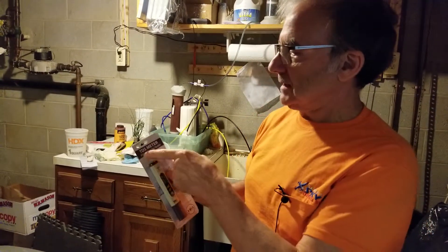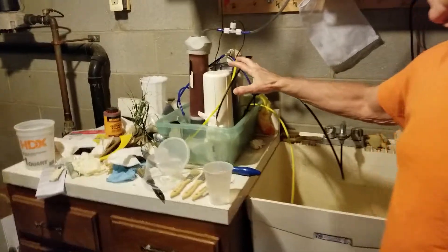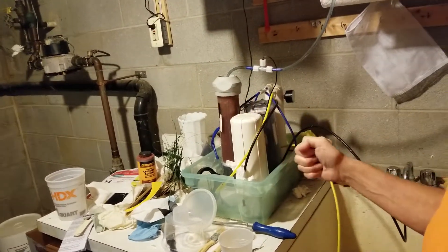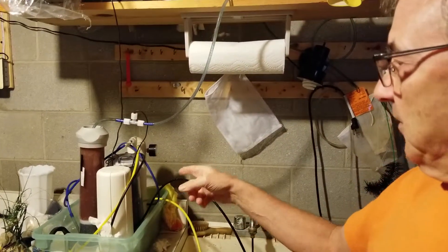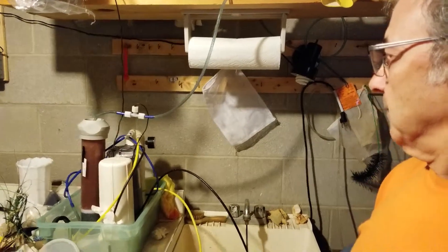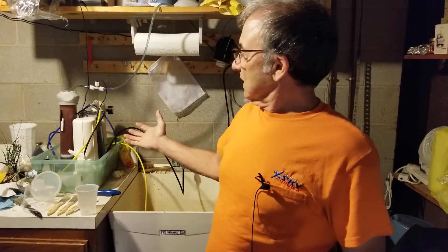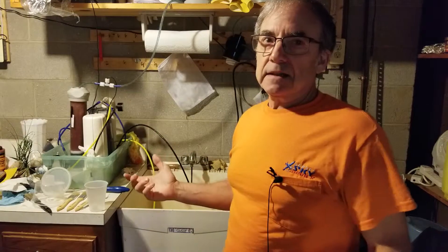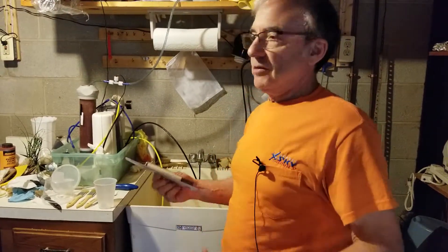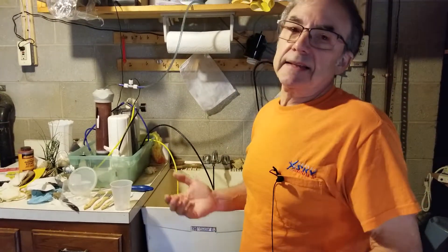This meter is for measuring total dissolved solids in water. When you have a filtration system like this four-stage system, which has a deionization filter, a reverse osmosis filter, and a charcoal filter that also filters by pore size, you want to make sure the filters are still working and that the water coming out is still pure. Eventually filters have to be replaced, but if you don't have a way to test the water, you might replace the filter too soon and waste money, or be using dirty water that you think is filtered but isn't.